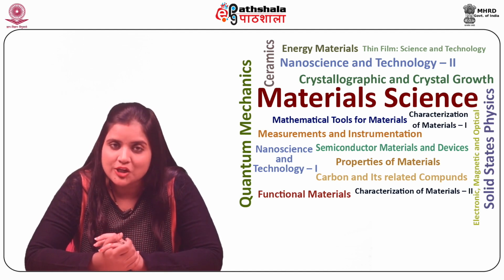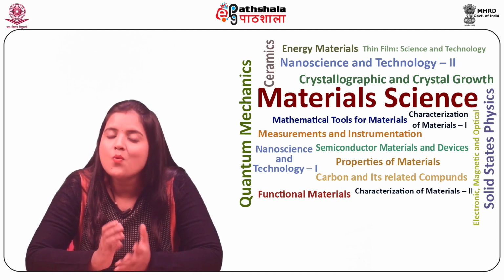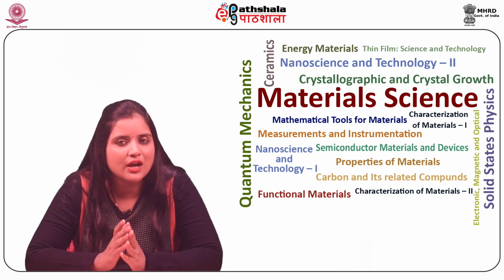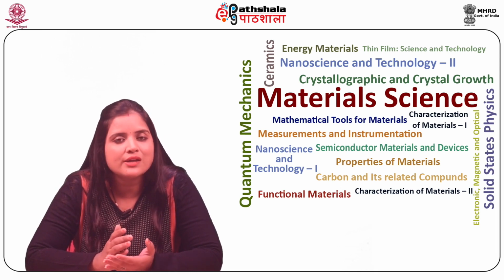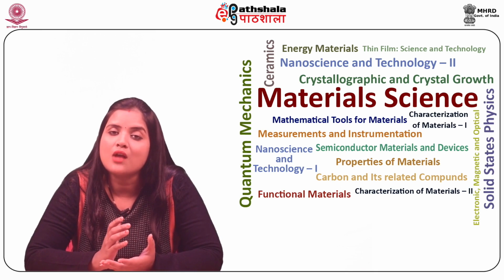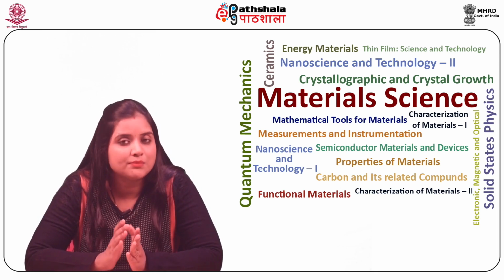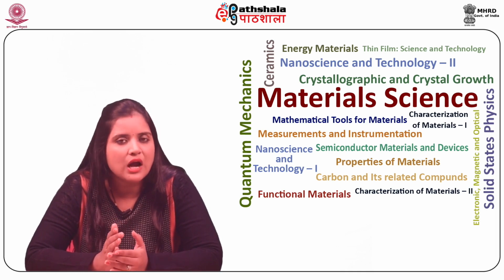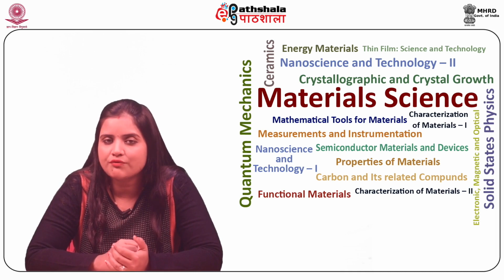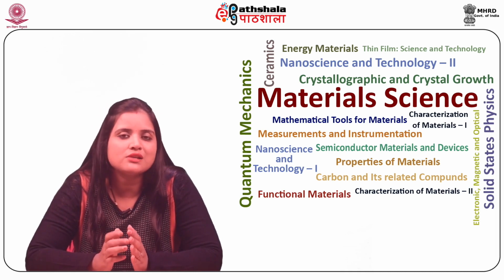Another important application of DHM is metrology. DHM facilitates accurate height measurements with excellent repeatability as well as good linearity without needing any vertical calibration. It has been employed for accurate positioning of mechanical parts, repeatability of interferometric piezo controllers, motorized displacement, etc.